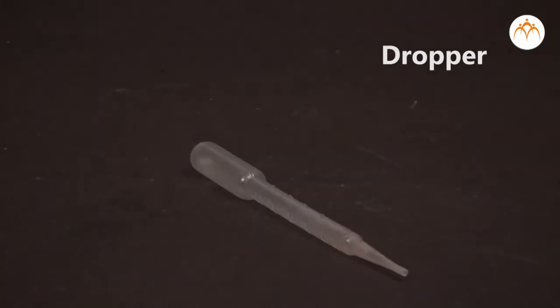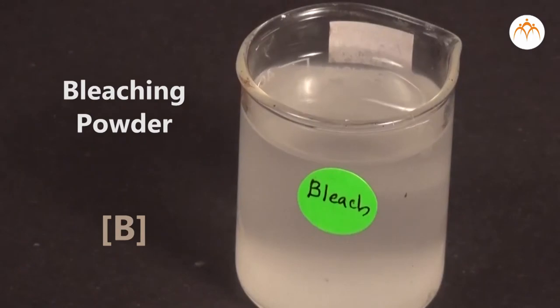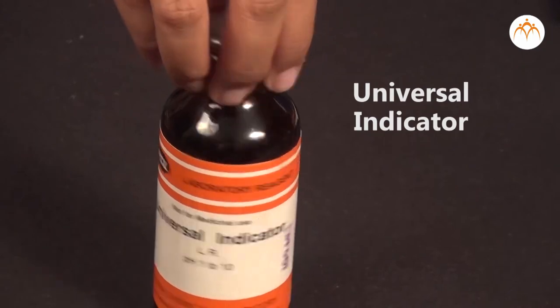test tube stand, dropper, etc. We also need sodium carbonate, bleaching powder, lemon juice, and indicators like litmus paper, universal indicator, etc.